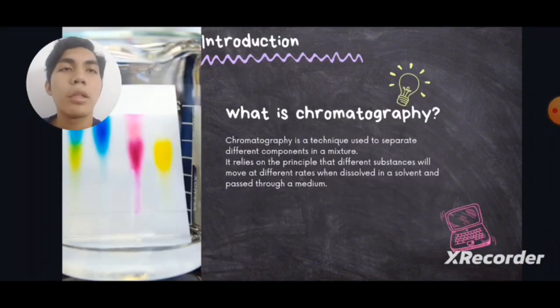What is chromatography? Chromatography is a technique used to separate different components in a mixture. It relies on the principle that different substances will move at different rates when dissolved in a solvent and pass through a medium or a surface. For our assignment, we will be making use of two chromatography methods, which will be discussed later.